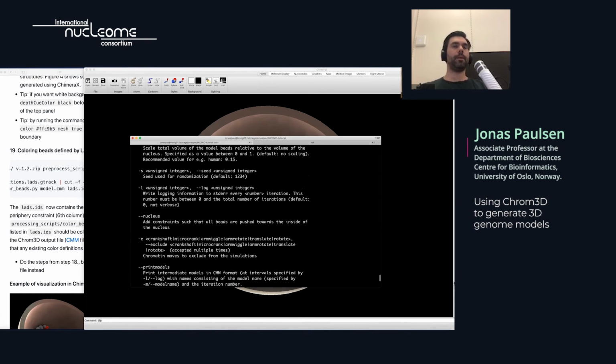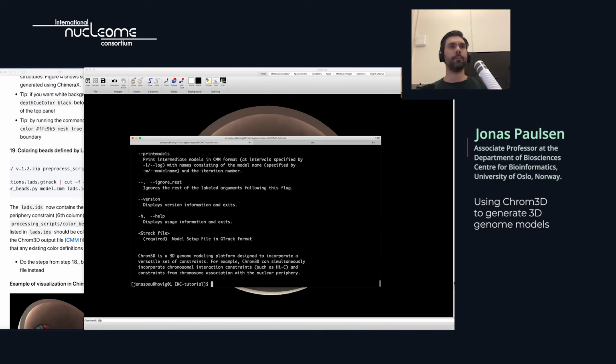Yes. So if you have now been able to download the new model, the one called RedLad, I will show you this one. I'll try not to look at both of them at the same time actually. So I'll just look at the model called red lad. This looks like this. You can see now some of the beads being colored red.